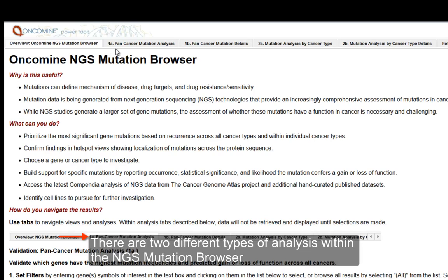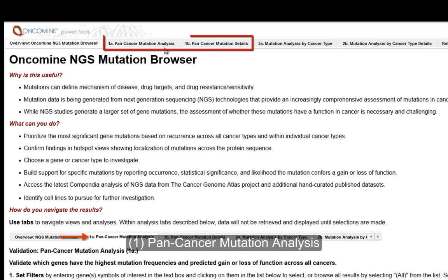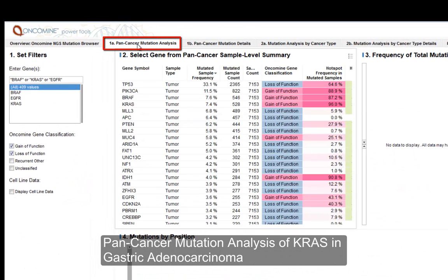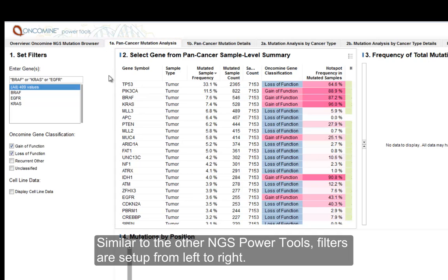There are two different types of analysis you can do within the NGS Mutation Browser: pan-cancer mutation analysis, or you can look at your mutations by cancer type. In this example, we're going to start with pan-cancer mutation analysis and investigate KRAS in gastric adenocarcinoma. Similar to the other NGS Power Tools, this tab works by setting the filters on the left-hand side and then exploring the updating views on the right.